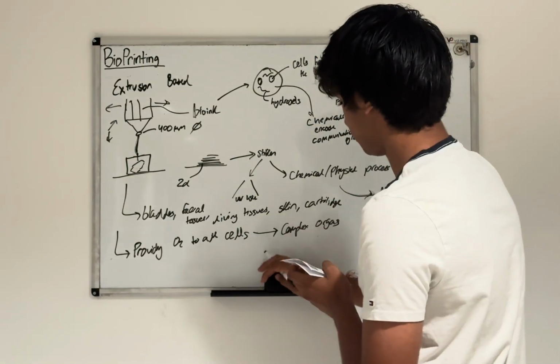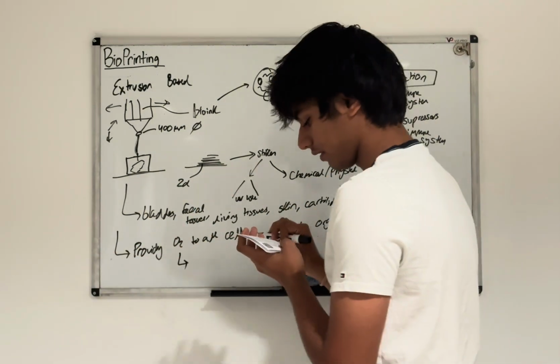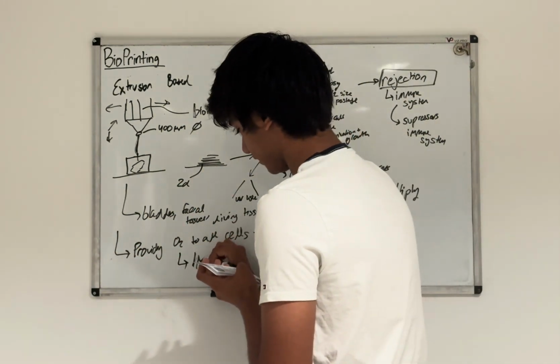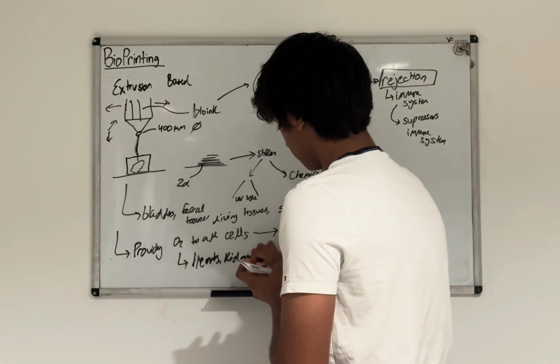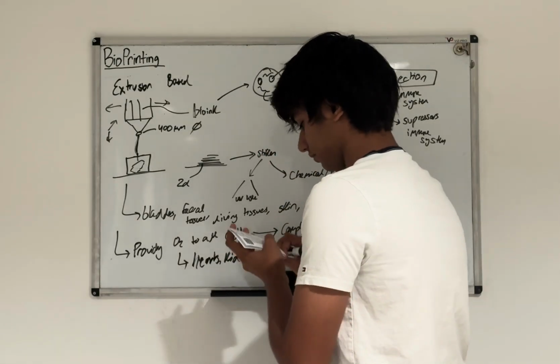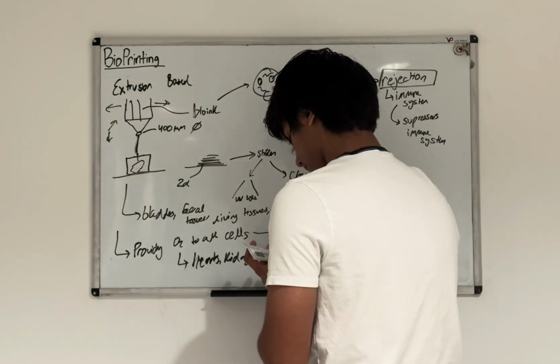But we have been able to successfully create mini versions and semi-functional versions of things like hearts and kidneys and livers, right? So researchers at universities have been able to create many versions of these critical organs.